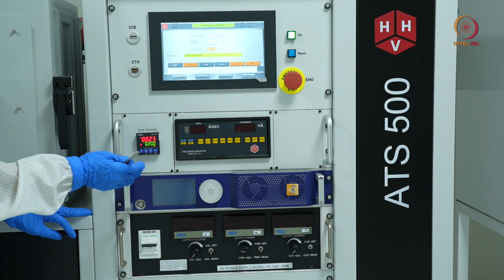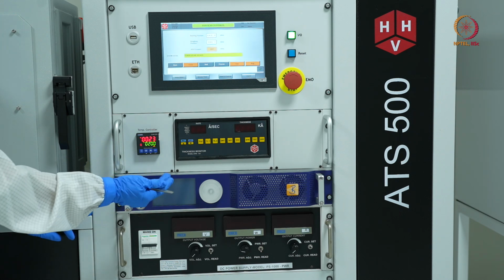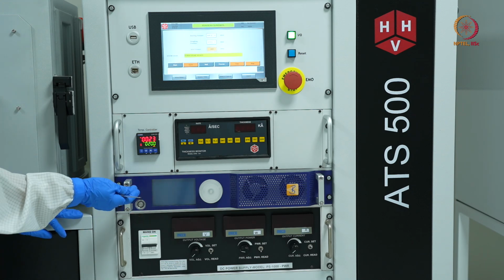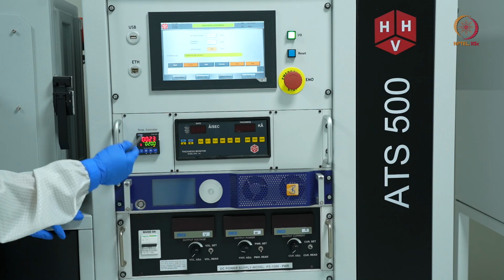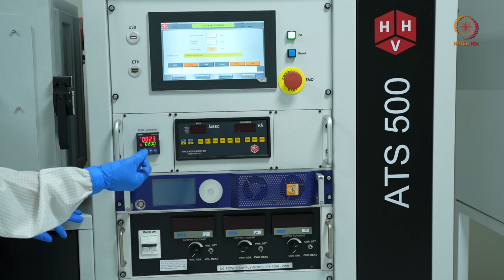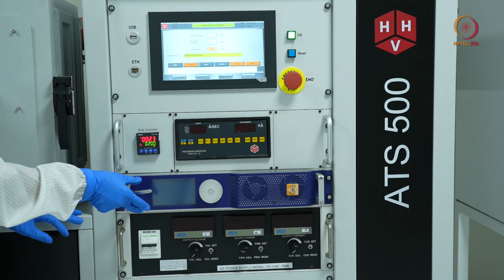But in the case of oxide or dielectric, wherein the free conducting electrons are very few, the argon atom will not find an electron to neutralize, which can be compensated with the RF signal.